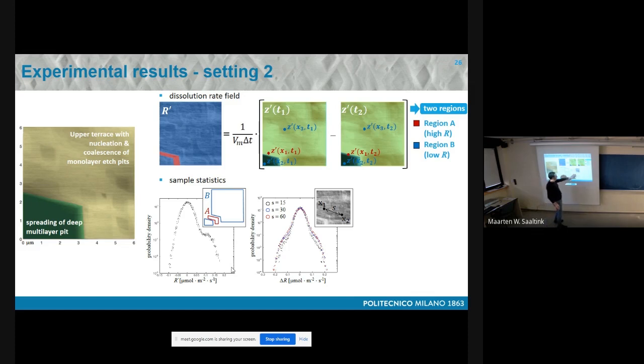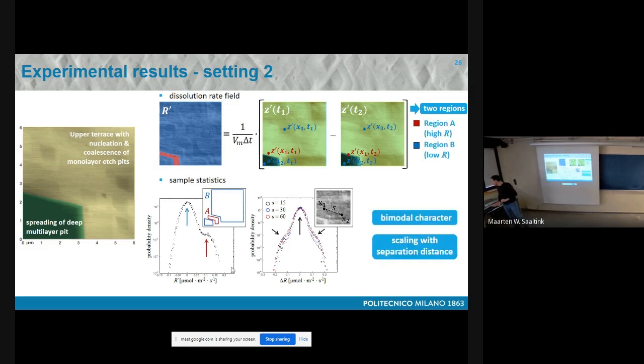This is just an example of spatial increments associated with 3 lags normalized according to the size of the system. And you can see several things in these distributions, which I'm going to comment on in detail in just a few minutes. First of all, you can see 2 peaks here simply because we have 2 regions. Okay? Then you can see a central peak and 2 lateral peaks in these distributions. Not only that, you can see that the distribution of the increments depends on the lag at which you take the increments, which is of course normal.